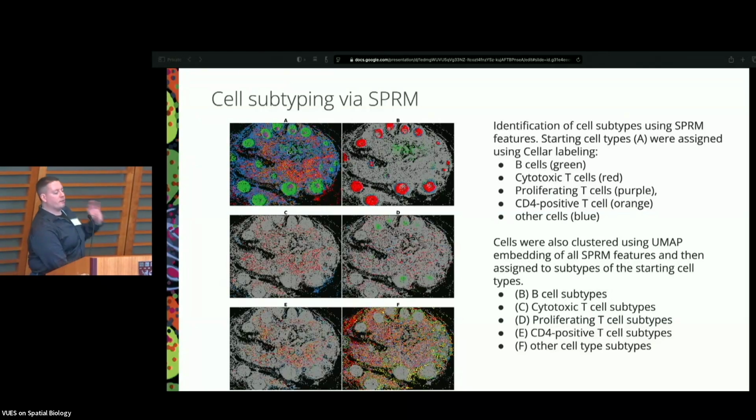So that's from whatever available cell type annotations. Is there enough signal to be able to pull these apart even further and then look spatially to see, does that make any sense? Clustering the other cells can be a free for all, but a lot of these specific cell types still do so with that spatial localization.